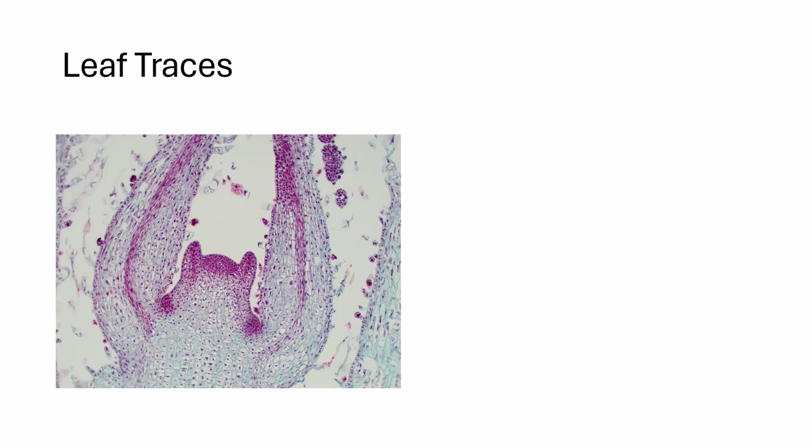Find a region where a developing leaf attaches to the stem. Observe how vascular tissue diverges into the leaf as a leaf trace, leaving a temporary leaf gap in the stem's vascular column. The leaf trace appears as a dark elongated strand of procambium. The leaf gap is ground tissue directly above the point where the leaf trace departs.